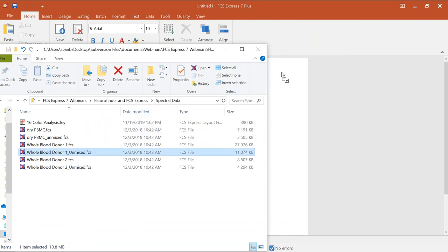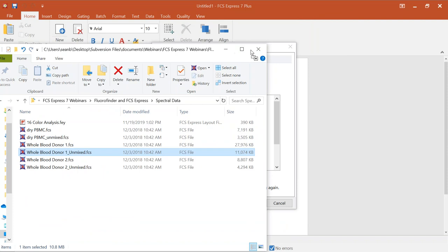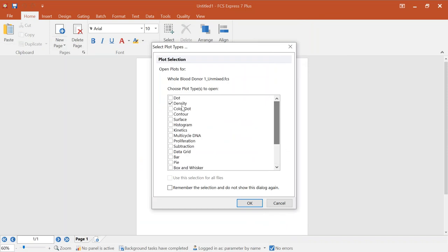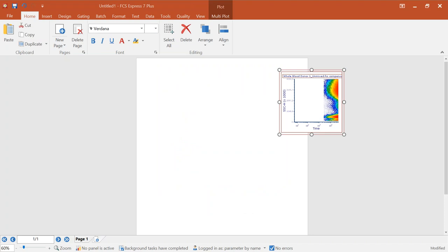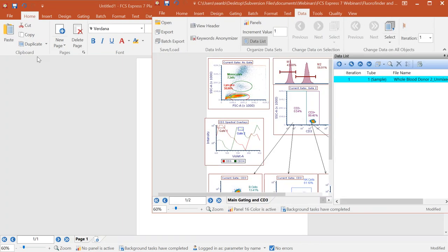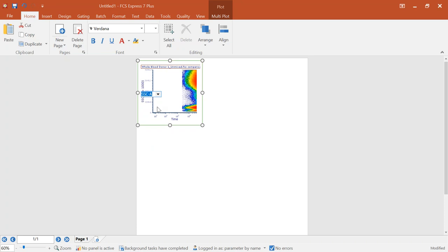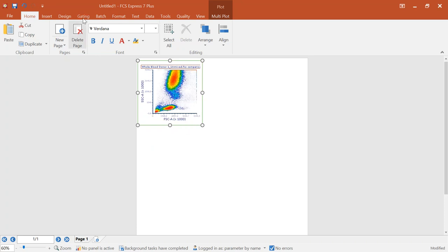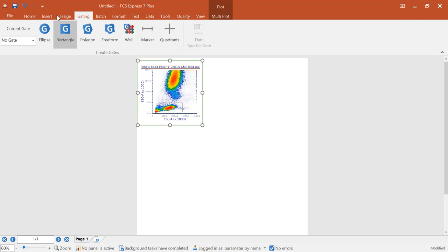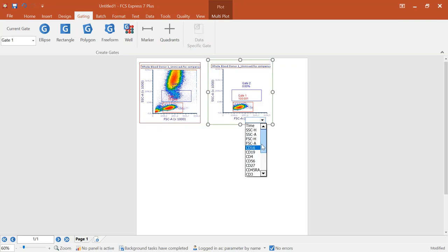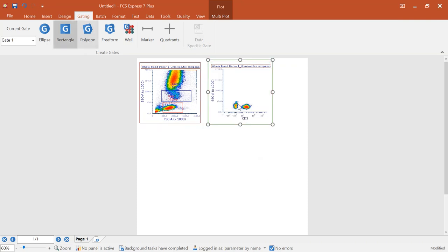The unmixed version is essentially the standard FCS file. The file without any suffix is the raw spectral data. All we need in FCS Express is if you have these two files in the same folder — we'll link them up so you can work with spectrum plots. If you don't want spectrum plots, you don't have to have both files; as long as you have the unmixed, you can work with it just like regular flow cytometry data. I'll drag and drop this unmixed data file into FCS Express, choose a density plot, and work with this just like standard flow cytometry data.